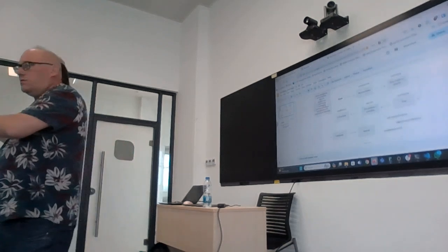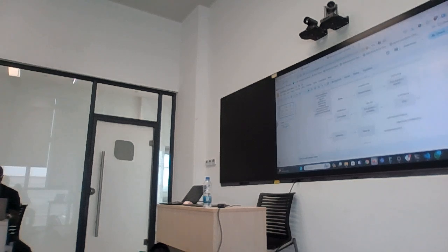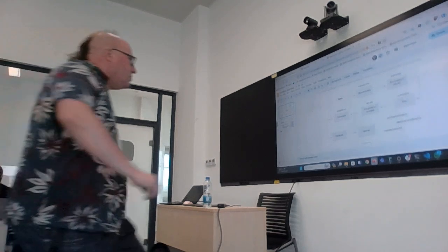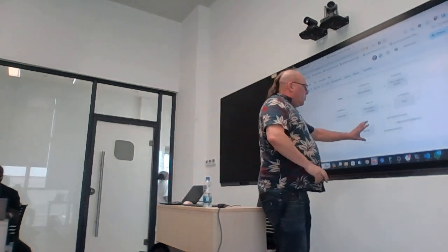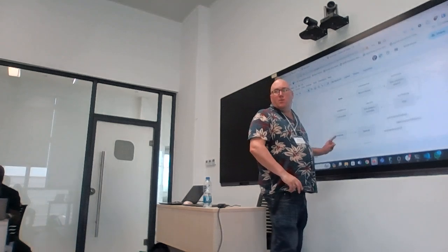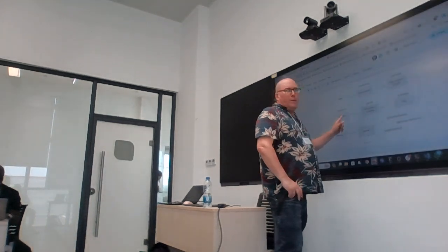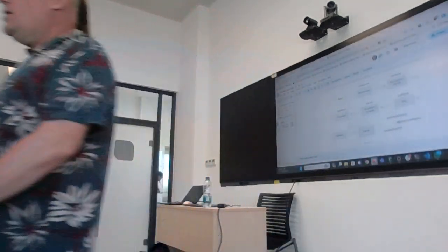This is a prettier version, thank you, Kirsty. This is a prettier version of what I drew on the whiteboard yesterday, the steps of the analysis, okay? Squirrel, we'll talk about squirrel later. We got the consensus, okay? Consensus, FASTA, okay? I want to go one step back. Consensus is made by calling variants, okay?